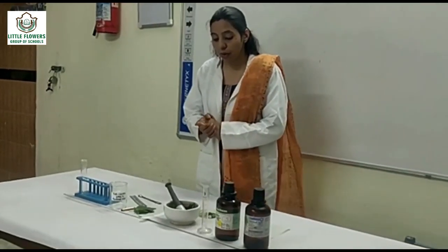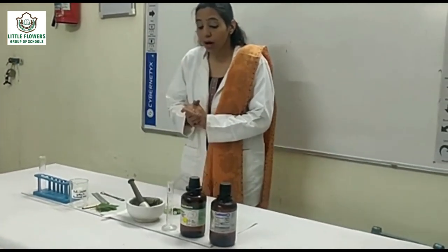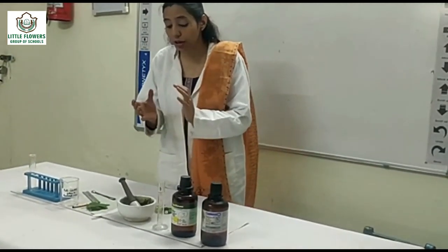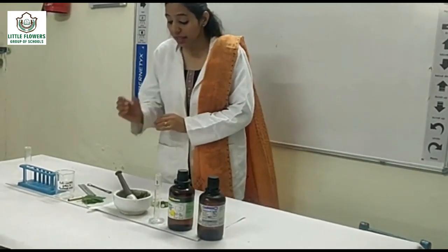Good morning all of you. Today we are going to perform an experiment to separate and examine the chlorophyll pigments from a given plant species.